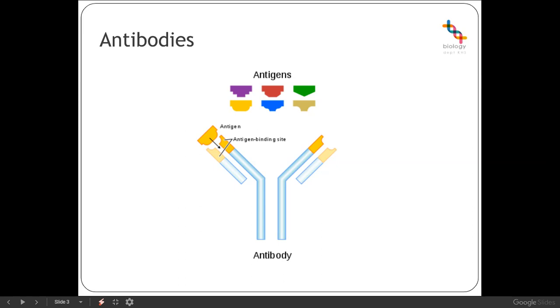So an immunoassay technique essentially exploits this ability of antibodies and antigens to bind to each other, and to do so with specificity. It's similar to the process of an enzyme and its substrate binding, but in this case a reaction is not necessarily catalyzed, so as a result you're not going to lose either molecule. So when we're wanting to identify proteins that are either antigens or antibodies, an immunoassay technique is usually the type of process that you would use.